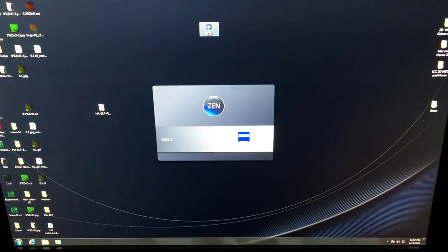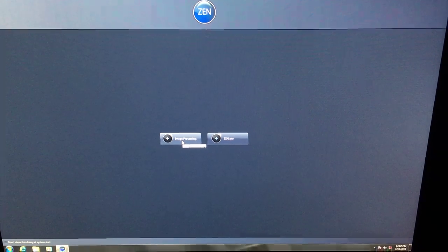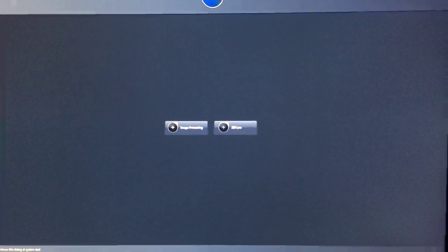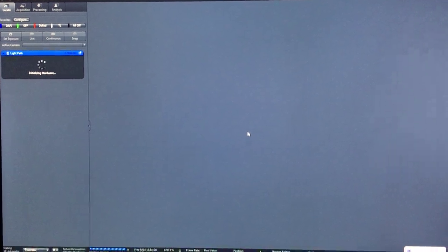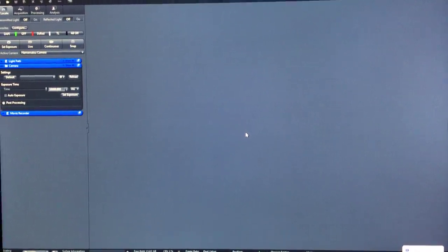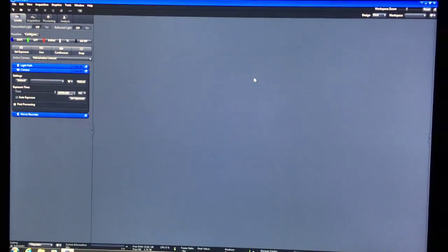For the software, go to Zen and double-click to open it. You have the option of image processing only—not controlling the microscope—or Zen Pro, which controls the microscope. It takes a while to initialize hardware; if you did the correct steps turning everything on, it should be able to see everything. No error messages means everything's fine. If you see error messages, something's not seen or broken—that's when you call me.